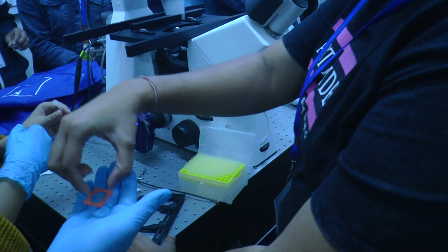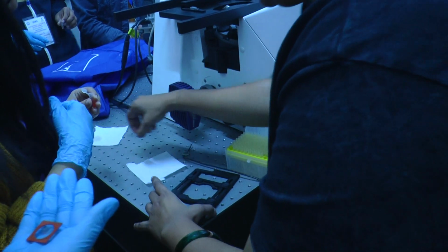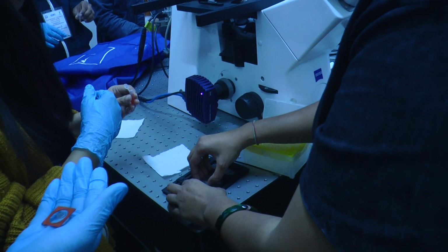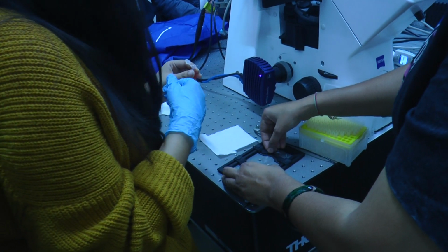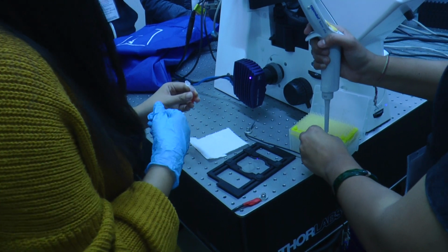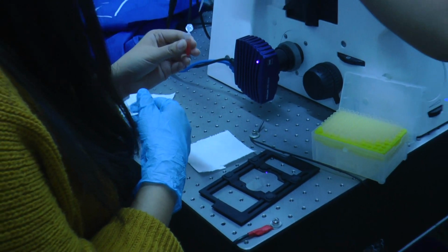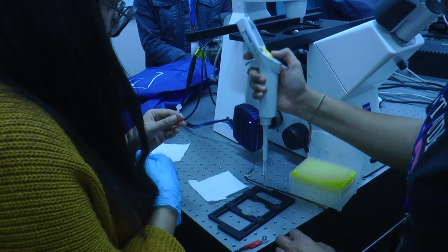Discard this. Not the spacer, you need the spacer. And this one? Cover slip and the sample, please discard in that white one. Yes, white. And what is the percent of this? 0.6. Sir called me, so I'll be waiting.